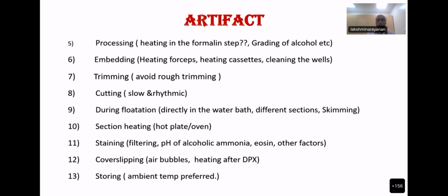And during flotation, 90% of the people put the section directly in the water bath. So the folds cannot be removed immediately because the water bath is a hot one. And different sections also, they take 3 or 4 in one go, and then one person will take the section from that. And there are chances that a lot of mistakes can happen. That means actually every section after cutting, you have to skim it and clean the water, and then only you can do it.